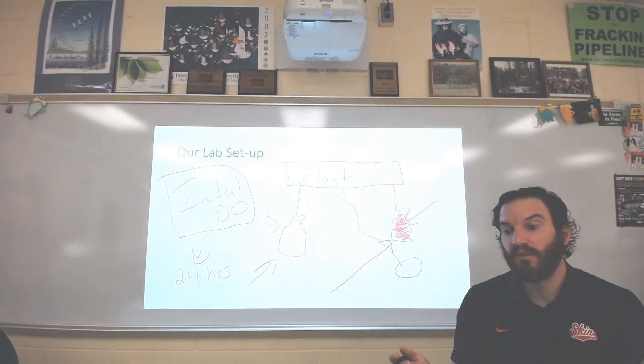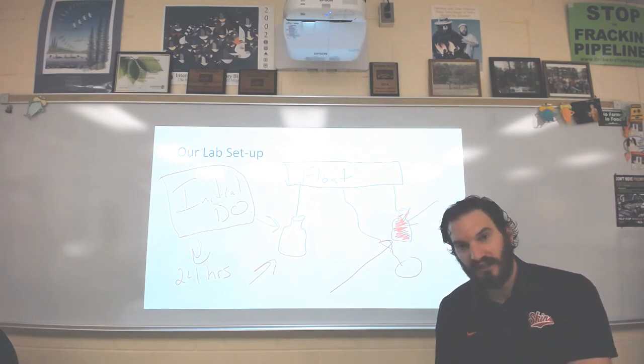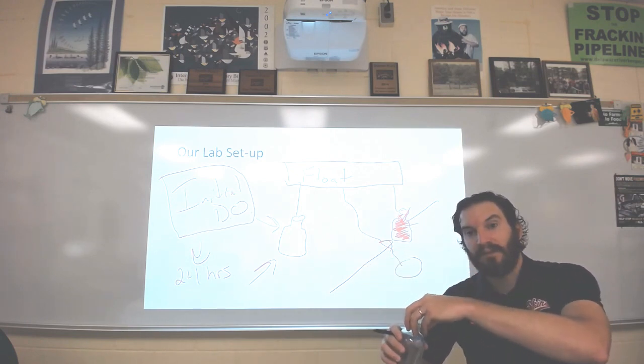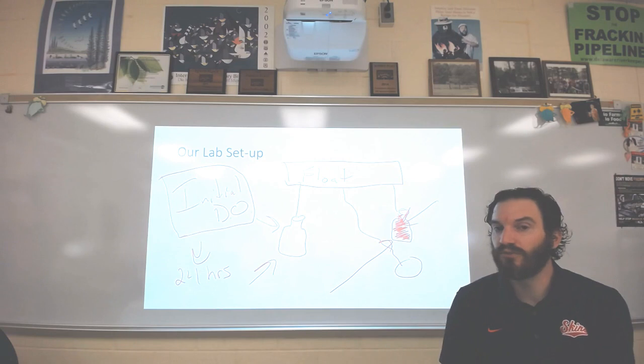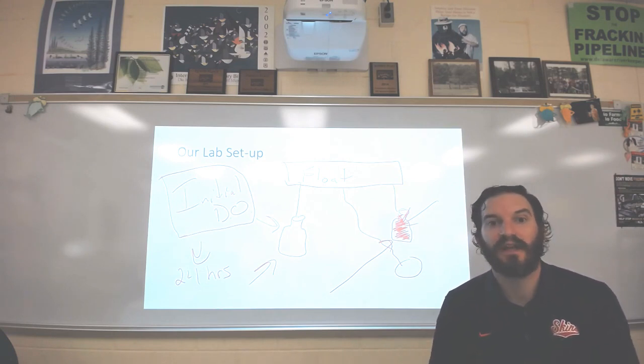Oh, I forgot one thing. When I go to fill them, I'm going to fill them underwater. So I'm going to completely get all the air out of this, and then cap it underwater so that I make sure it has no oxygen inside of it, no air bubbles, because air bubbles can really alter my data. So I want only Neshaminy Creek water in that jar.